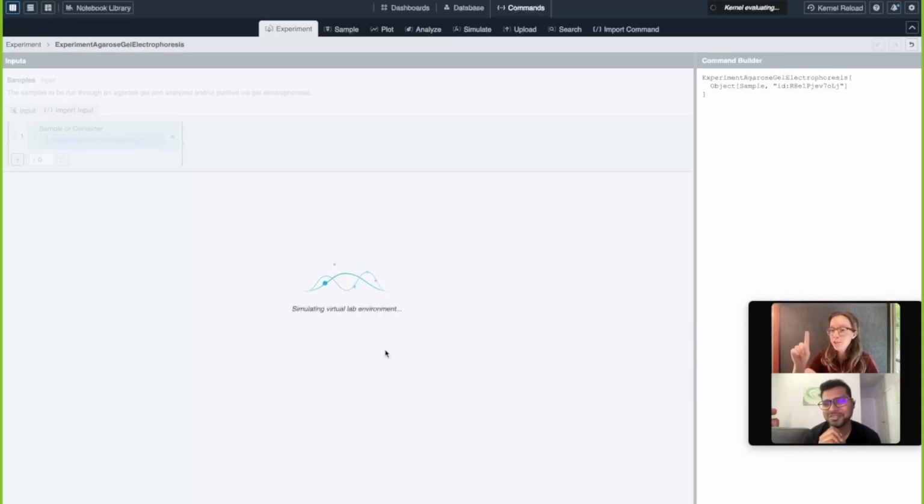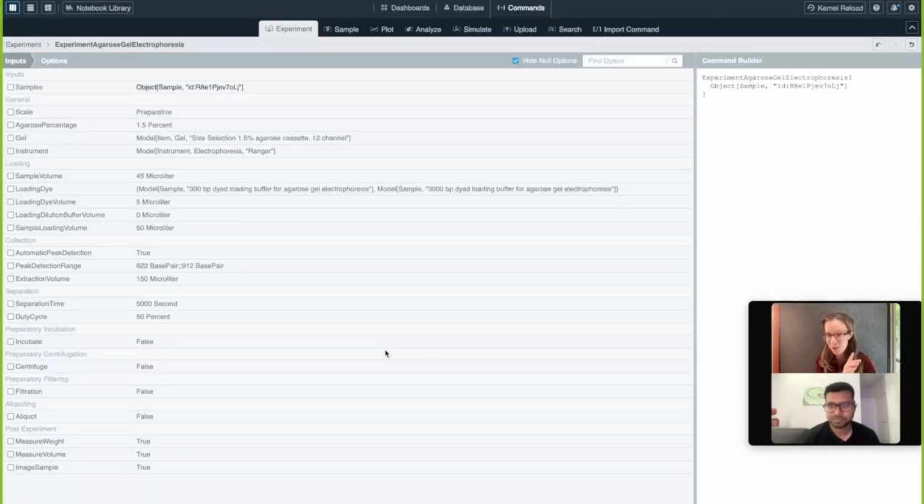No, right? But it could do that. It doesn't do that as of now. No, it does not. But the system does, in other scenarios that are closer to chemistry, know a lot about the chemical composition of things, and it will do things like pick the right tip size for this or whatever. The idea is that in this step it can suggest defaults for you that actually make sense in the context of this specific sample that you're using.